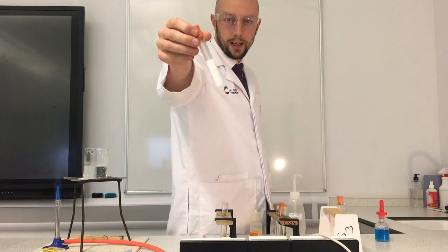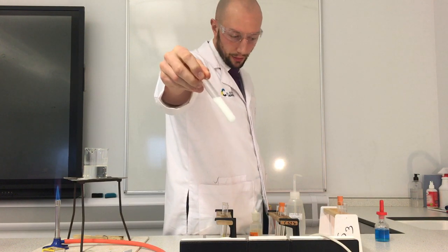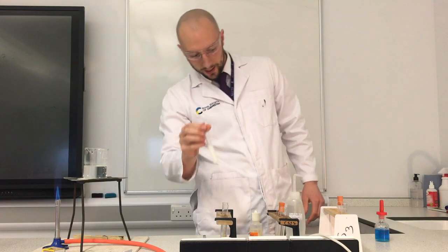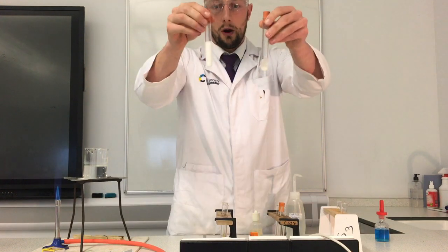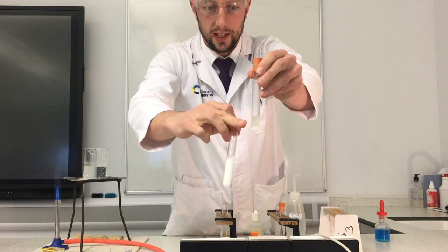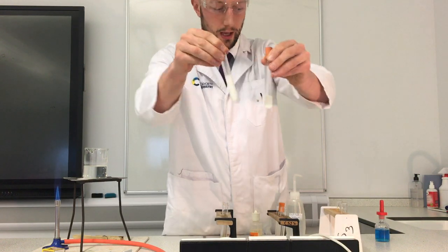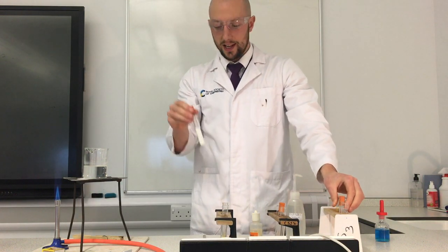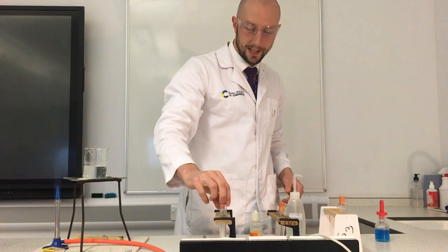And look at that. It's just like a glass of milk. It's gone really cloudy and milky with the ethanol and water. That tells me that there's fat in there. If we compare that now to what the one with the energy drink was like, we can see the energy drink is quite clear compared to this one, which is very, very milky. So that tells me there must be fat in my oil. My oil that I cooked with has definitely got fat in it.